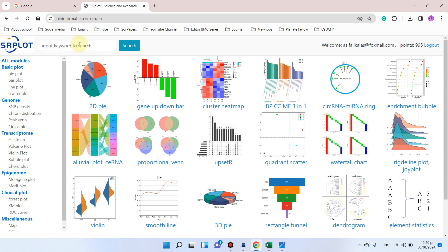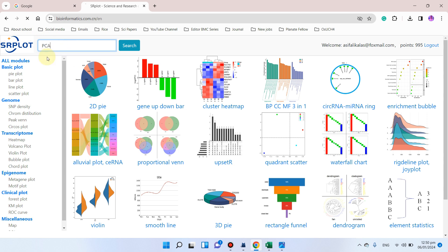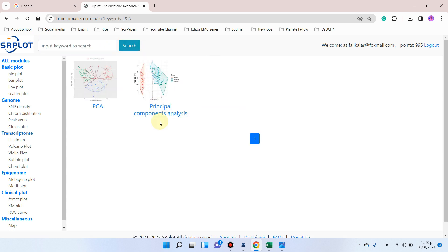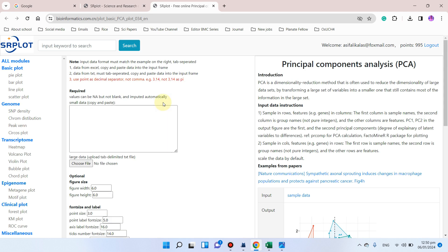Since we want to draw PCA analysis and I have already logged in, I can simply type 'PCA' in the search box. Here you can see we have PCA results showing two different graphs for principal component analysis. The simplest one is the first option — clicking on it will take you to the data input window.